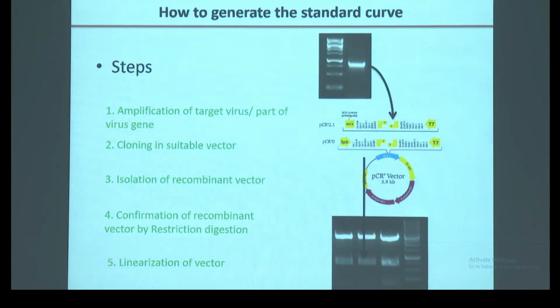वो पूरा circular में नहीं रहेगा, it will get linearized. So that gives a good estimation. आप circular से standard बनाने की कोशिश करेंगे, that also will not give a reliable standard every time. वो आपको every time अलग अलग PCR efficiency के साथ में PCR होगा. So you have to cut it from one side. Then you have to run on gel.